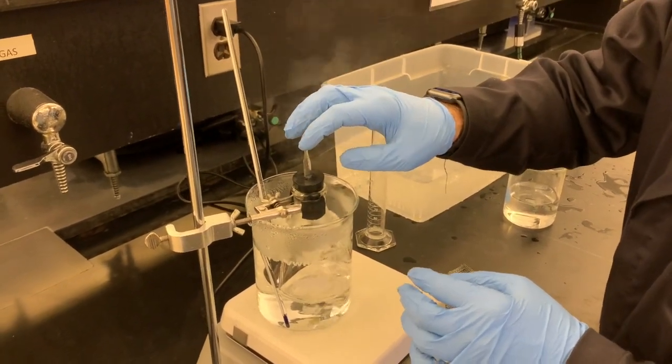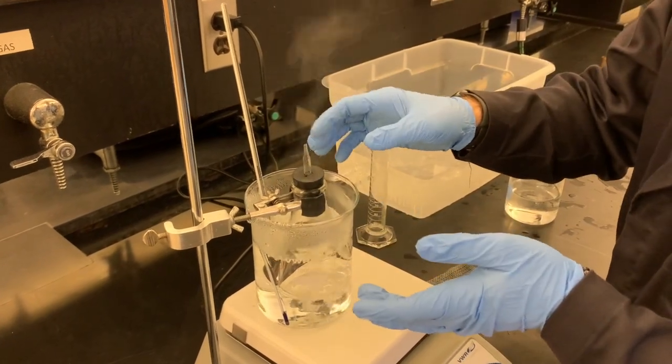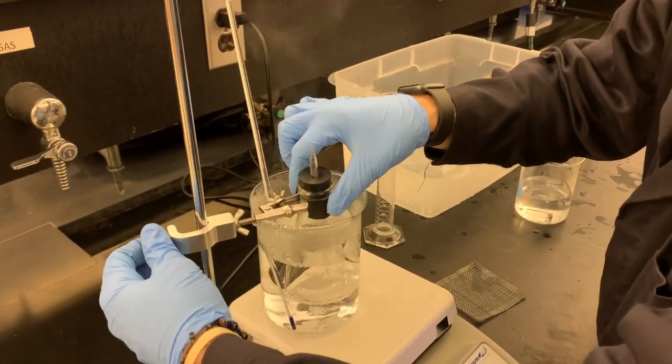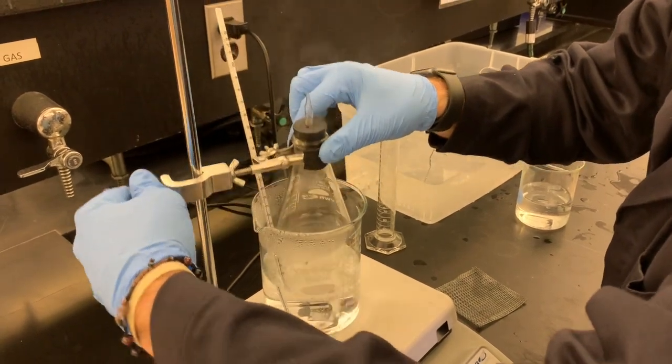And that's to make sure that as the flask cools in the air, it doesn't already start taking on gas that we can't compensate for because of the temperature change, or that we can't account for anyway. Must be the end of the day, I'm mixing up my words. All right, so here goes.